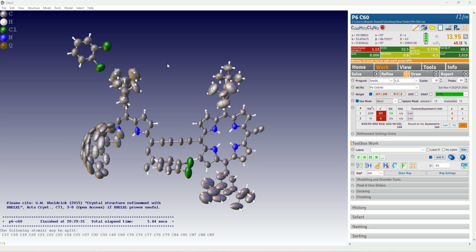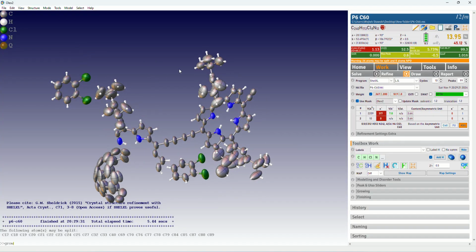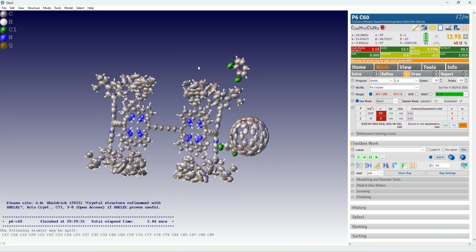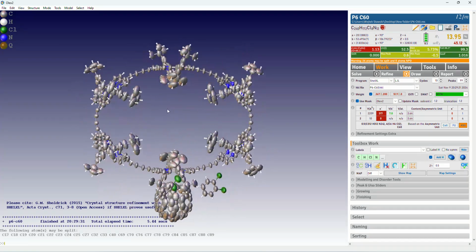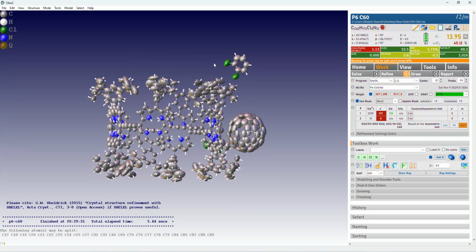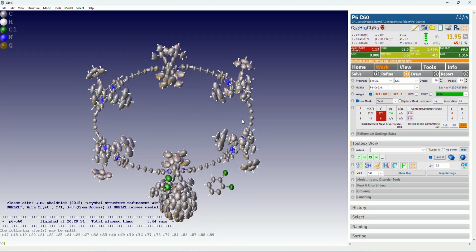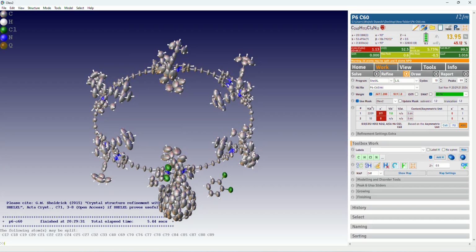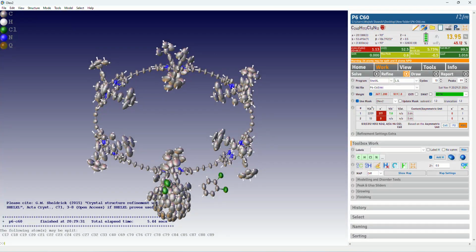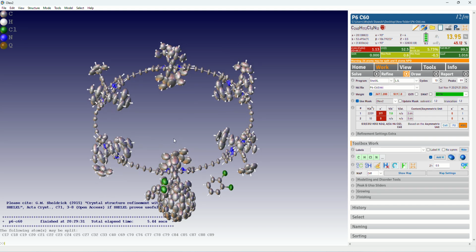So if you have a structure such as this one, it's a really bad structure. I can grow it right now. It's a very nice nanoring consisting of 6 porphyrins, and the main reason for publishing this structure was that it's quite surprisingly flexible. Usually we think about pi systems as quite rigid systems, right? But here the nanoring is bent to an elliptical conformation and also co-crystallized with fullerene. So one nanoring molecule is surrounded by 6 fullerenes that pi stack to the porphyrin walls. But anyway, the point is, this is not a very good structure.